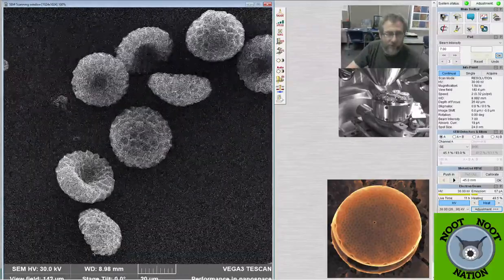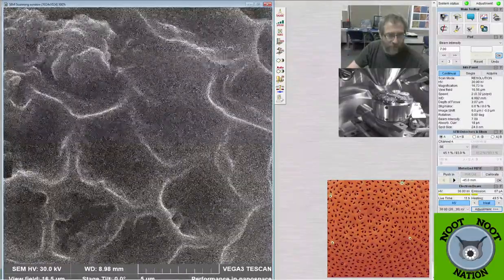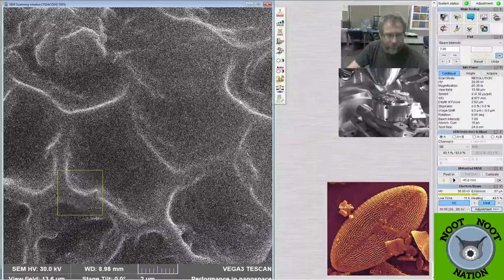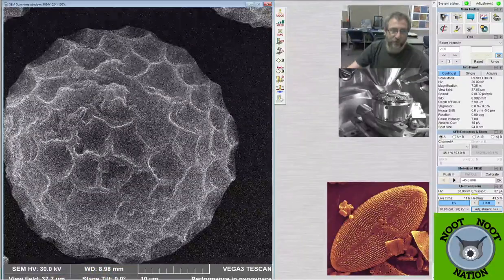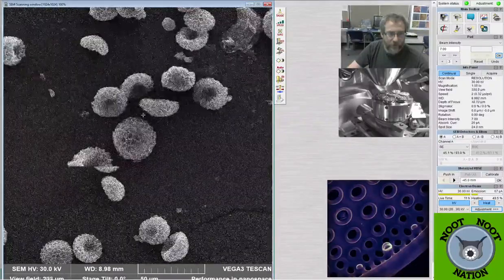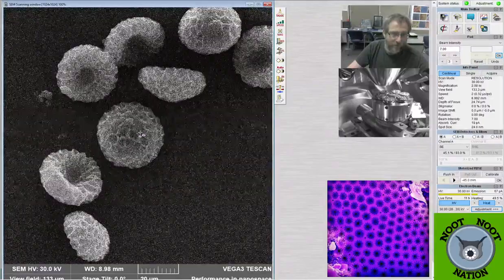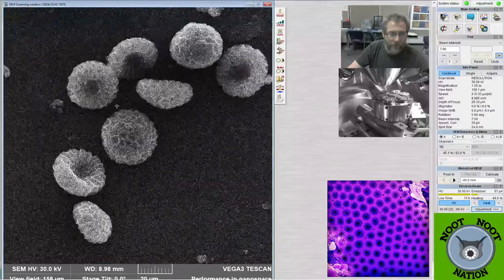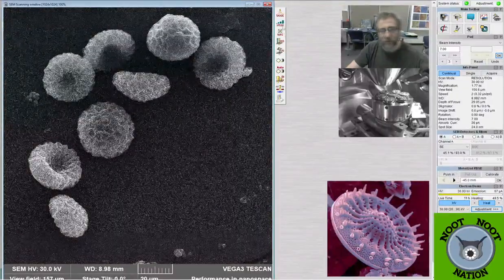So for these in particular that we're looking at, if I wanted to get more detail, if I wanted to zoom in and see even more detail, like if I just keep getting tighter and tighter in, if you're wondering what happens if I just keep zooming, it'll eventually start to get blurry. And so I need to get the material closer to the actual beam in order to improve the image quality at that point. And then there's a limit to how close I can get to my sample and have it matter, really. So right now we're running at 8 or about 9 on our working distance from the sample. And see, there's a whole bunch of this Phlox pollen.